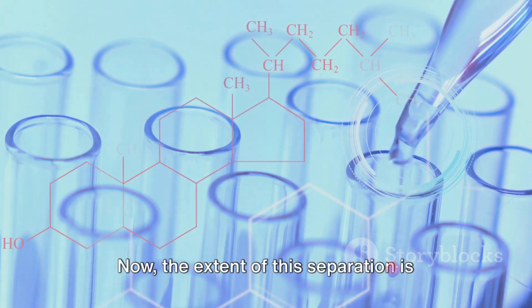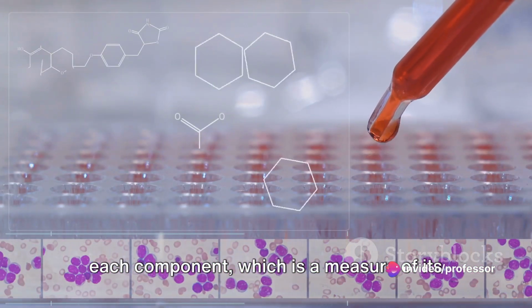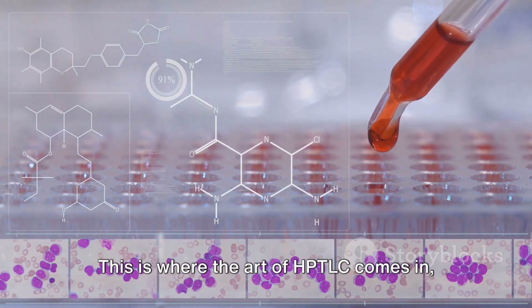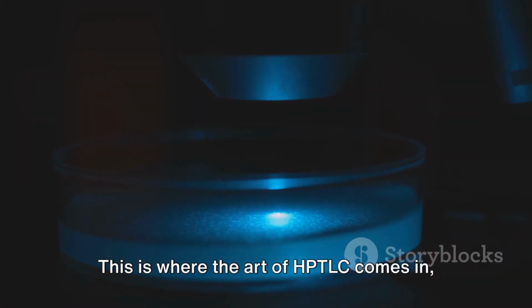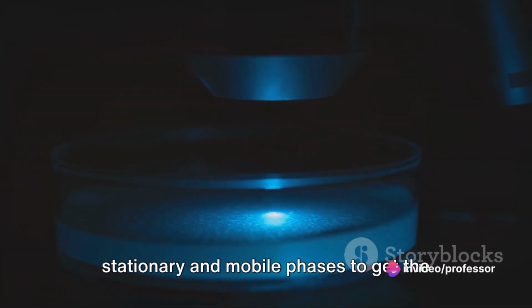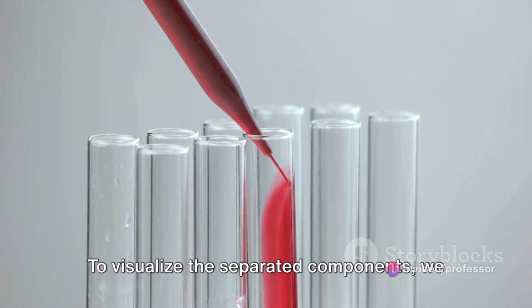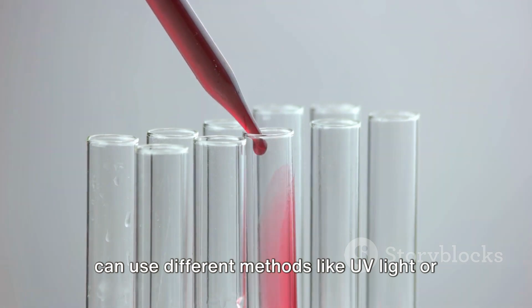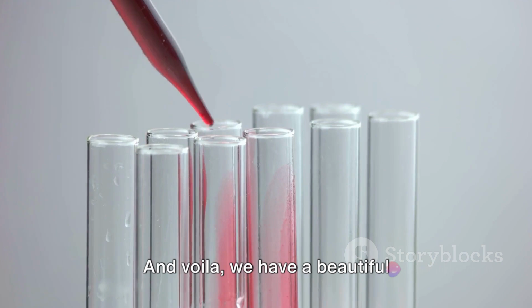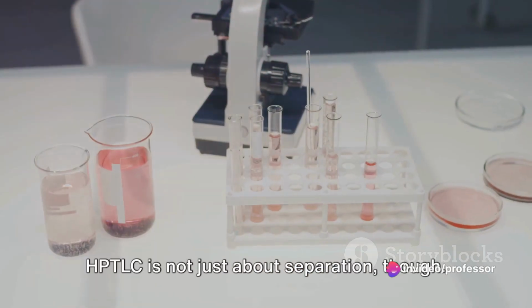Now, the extent of this separation is determined by the partition coefficient of each component, which is a measure of its relative affinity for the stationary and mobile phases. This is where the art of HPTLC comes in, choosing the right combination of stationary and mobile phases to get the best possible separation. To visualize the separated components, we can use different methods like UV light or chemical staining depending on the nature of the components. And voila, we have a beautiful chromatogram, a snapshot of the mixture in its separated form.